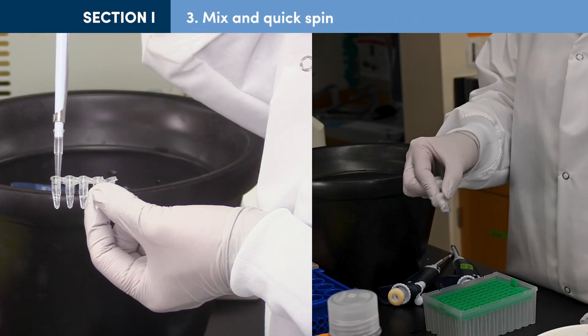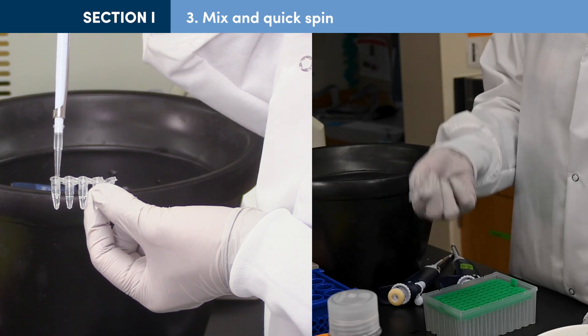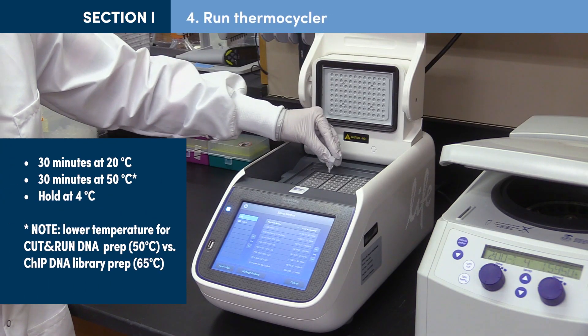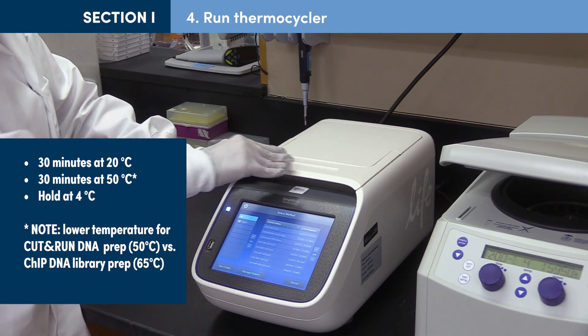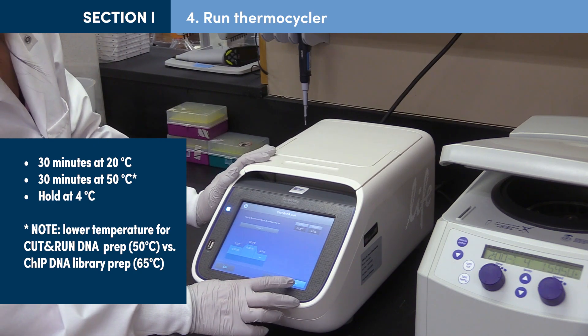Mix each reaction by pipetting up and down or inverting the tube at least 10 times. Perform a quick spin to collect liquid at the bottom of the tube. Place PCR tubes in a thermocycler using the program shown here. Note the lower temperature used for the Cut and Run DNA compared to the library prep protocol for ChIP DNA.